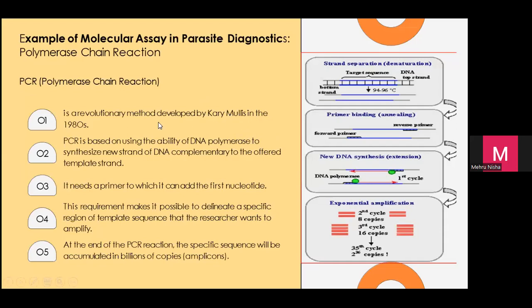Okay, just to tell, PCR ni selain daripada field of parasite, kita juga guna PCR untuk virus, bakteria, fungal, case cancer, yes, and also importantly forensic science, dalam case jenayah. So you know, masa case jenayah usually the pembunuh tak tinggalkan banyak dia punya DNA.